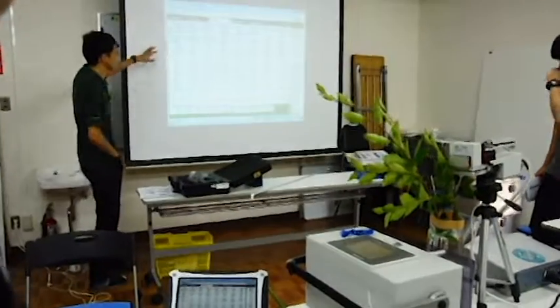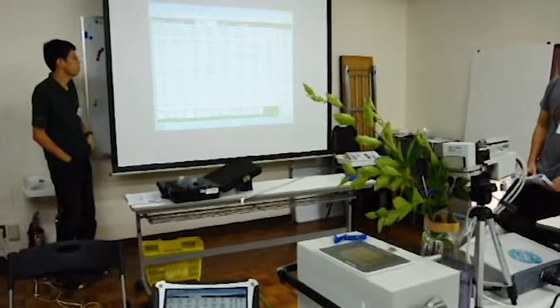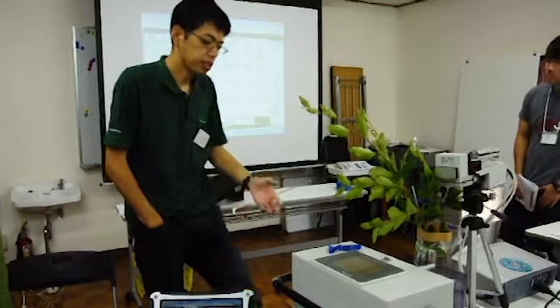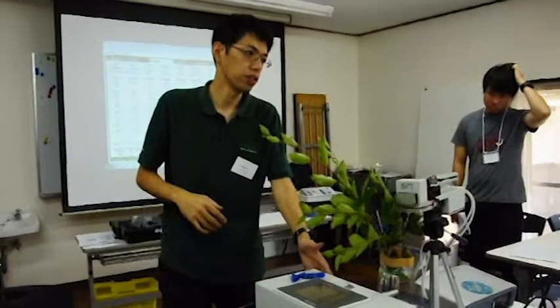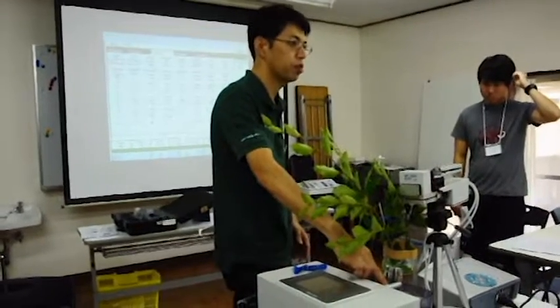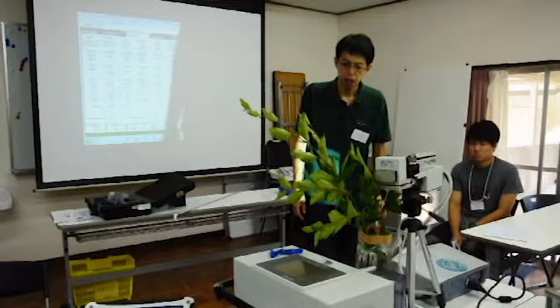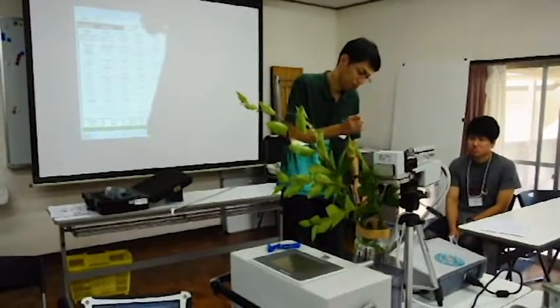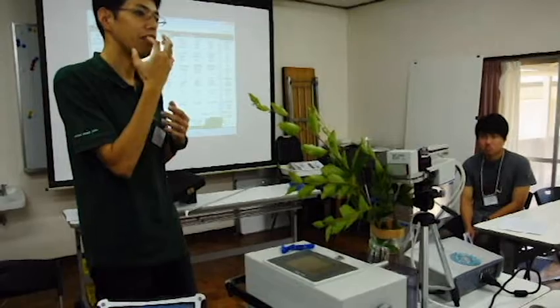And this is the CO2 concentration in the cuvette. In this system, I set the parameter at 390. And this is the CO2 cartridge, a small cylinder. Liquid CO2 is inside, installed here, at very high pressure. And this is a CO2 absorber chemical. Now this system takes the air from the ambient. Of course, the CO2 concentration in this room is probably over 1000 because we respire. The CO2 concentration around our mouth is about 10,000 ppm.